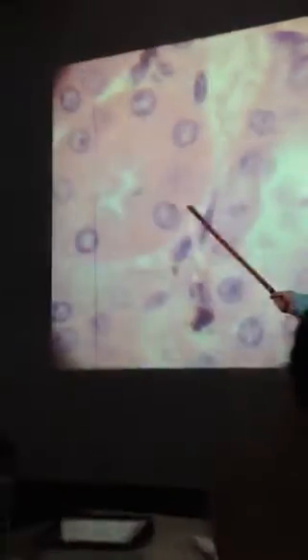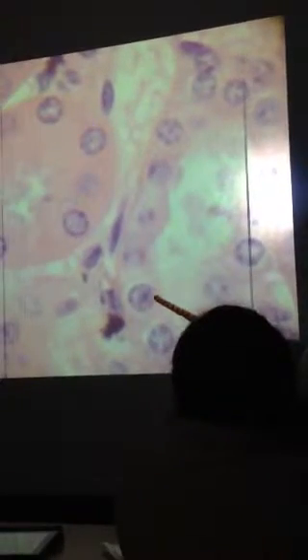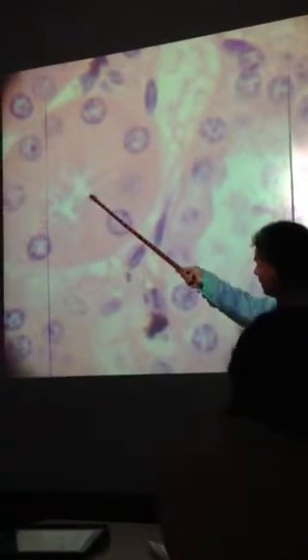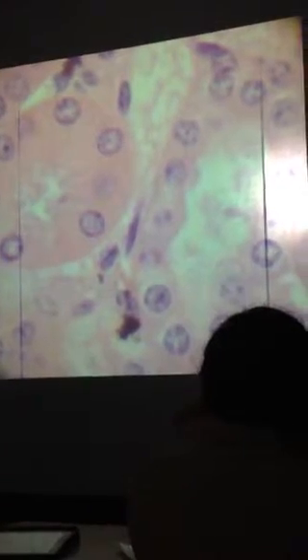Okay, what are these? Kidney tubules. Which ones? Proximal and distal. They're both, right. Here's your proximal. See how thick it is? See how the nucleus is nice and round? Here's your distal, right? See how thin it is? Nice round nucleus. Can you not see a difference between this and this? If I showed you this, you should tell me it's from the kidney. It has a proximal and distal convoluted tubule, right? Does anybody have a problem with those? Straightforward.